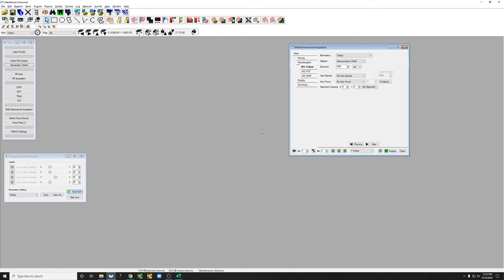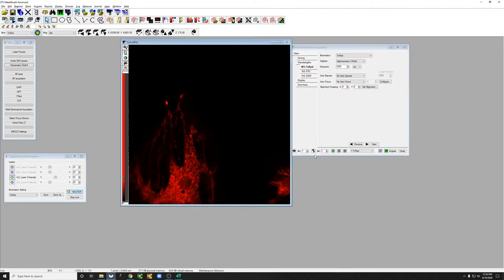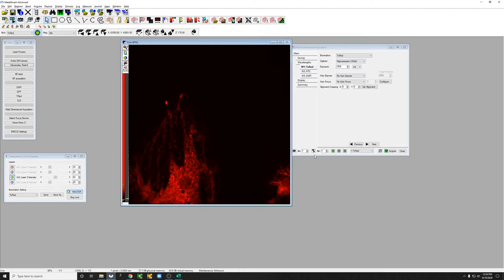I've reset all the settings to how they were when we were on the Hamamatsu flash. I'm just going to confirm that things are in focus. I'm just going to move it slightly.